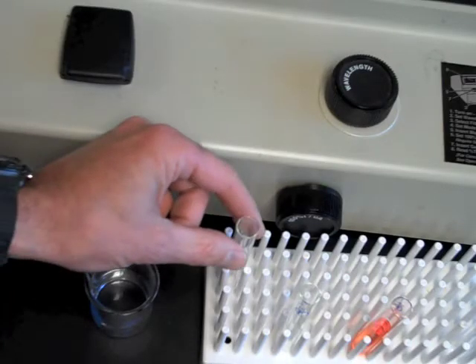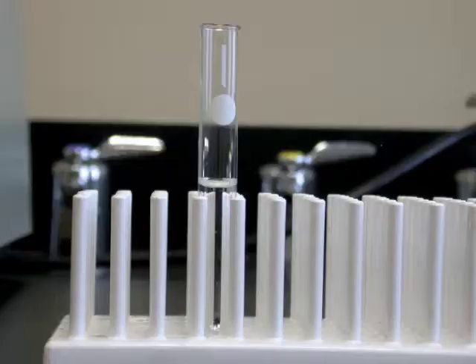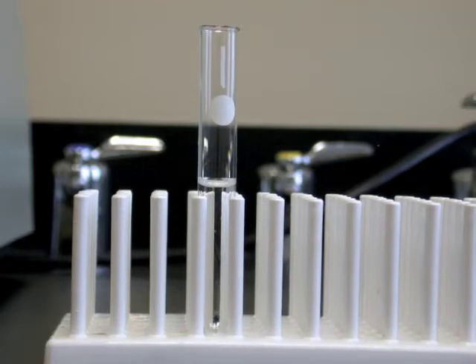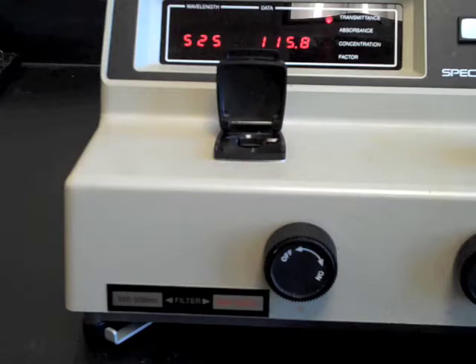Pour whatever solvent or buffer has been used to make the standard solutions of the analyte into a cuvette. This solution should contain all of the reagents in the standard solutions with the exception of the analyte. This is known as a blank solution. Today our blank is deionized water.